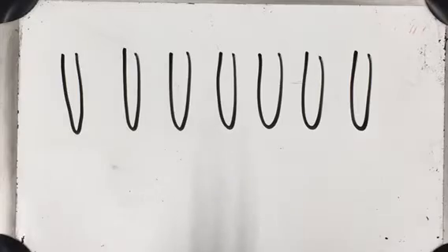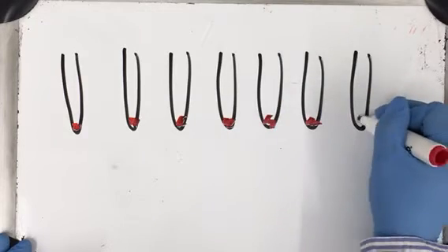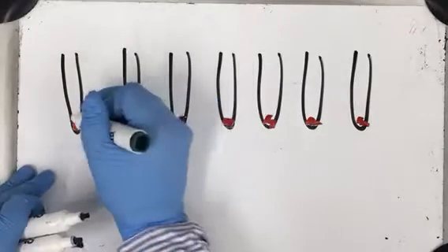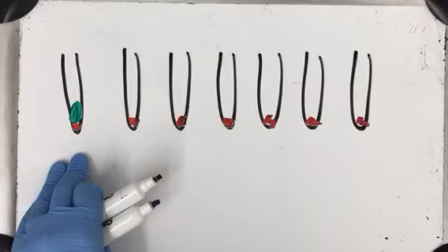Then after you've added those first chemicals to each one, for sample 1, we're going to add bacteria cells. These actually have the enzyme capable of beta-galactosidase activity. So we're going to add about 500 microliters of those cells.